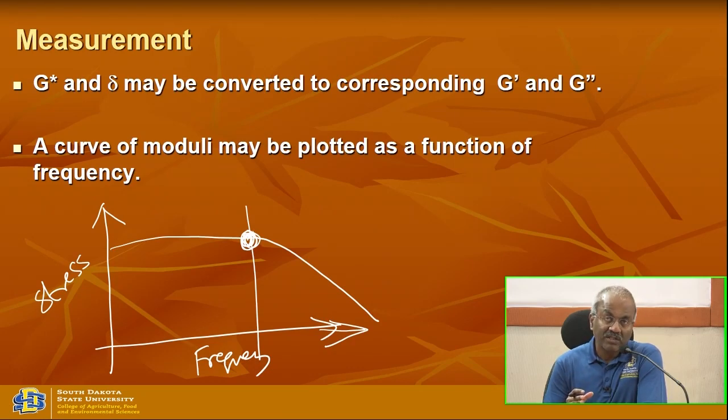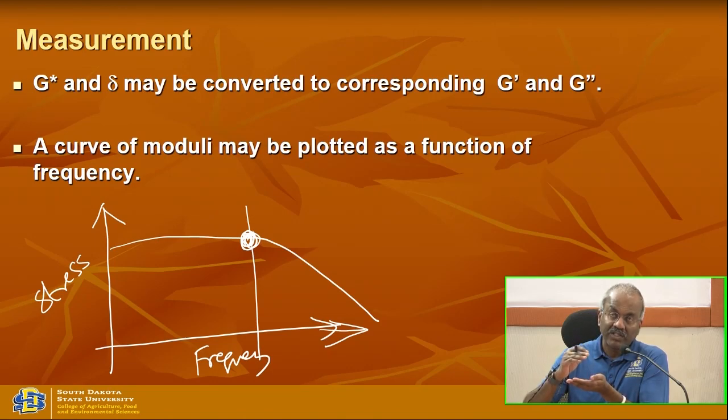So what is the linear viscoelastic region here? It is where whatever strain you are applying and the output stress you are getting, whether during the sinusoidal wave loading or unloading, it will be the same thing. If you go to the non-linear region, you are going to damage the sample. When I say damage the sample, I don't mean actually damaging it, but you are going to really compress the sample, and that's not going to give you the correct results.